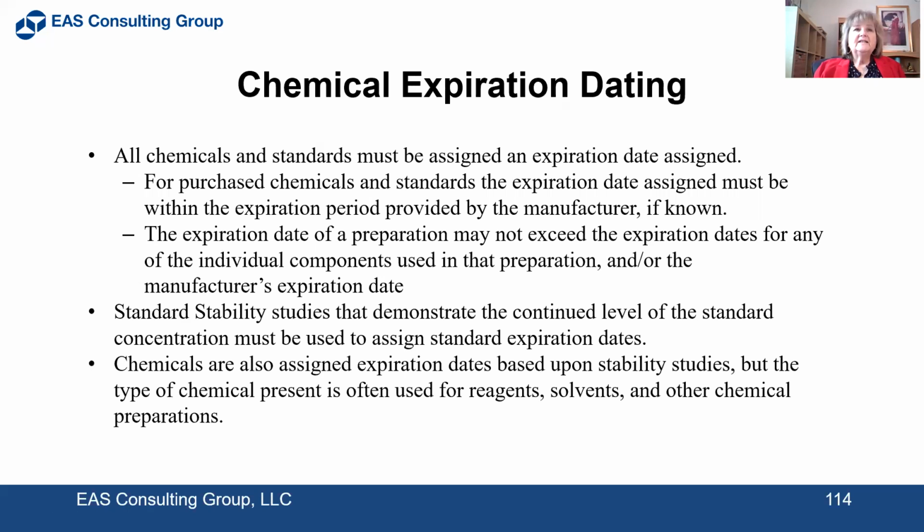Standard stability studies that demonstrate the continued level of the standard concentration must be used to assign standard expiration dates. If you don't do a stability experiment for a standard, then you must make it fresh every day. Chemicals are also assigned expiration dates based on stability studies, but the type of chemical present is often used for reagents, solvents, and other chemical preparations.